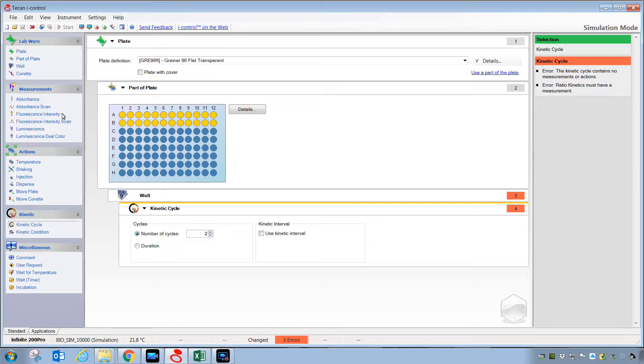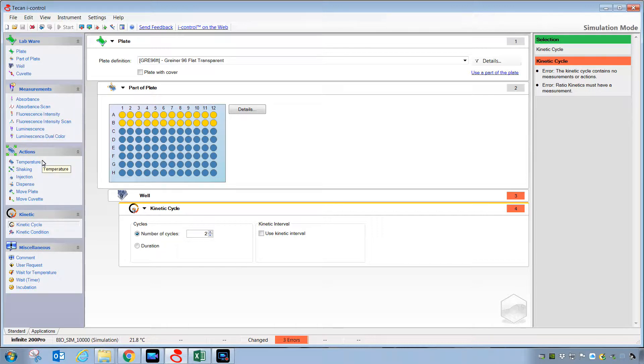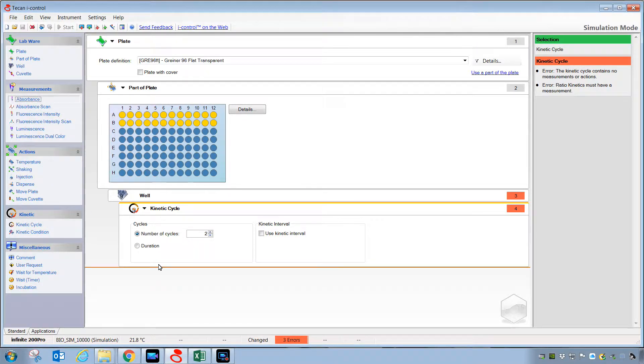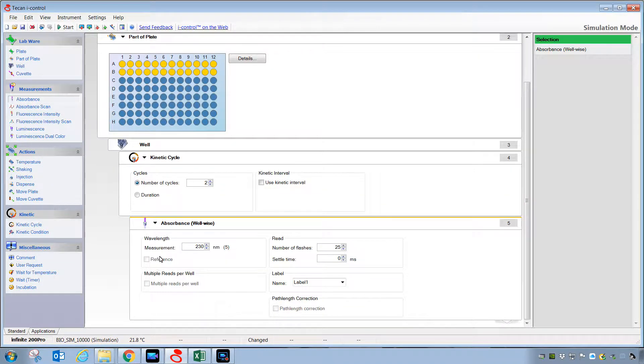Then, depending on how you're going to enact the kinetic, you can grab various things like measurements or actions or some other miscellaneous steps, but for right now, we're just going to grab an absorbance step and place it in the screen here.